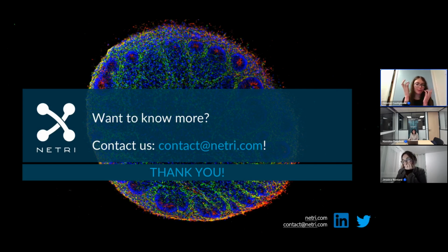Otherwise, it would be possible also to make a co-culture of, for instance, glioblastoma and cerebral organoids. It is often done and has already been done by some labs. And yes, so several possibilities. Okay, that's interesting. Thank you, Eloise.